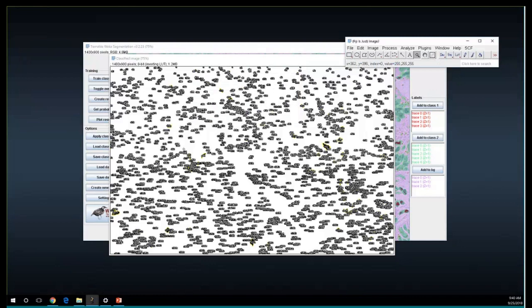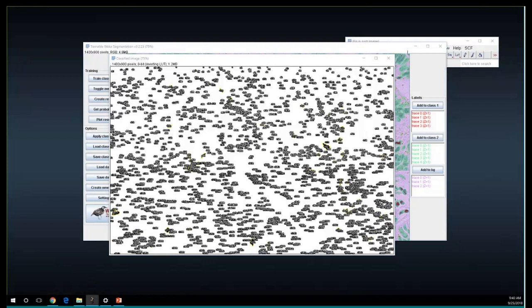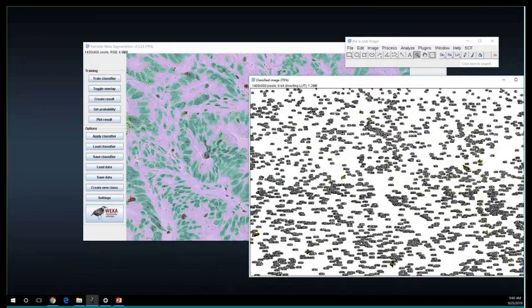But also there are tiny particles that don't represent the real dot, a single dot for the probe. So the best way to do that is you want to go back to your original image, and estimate what the number of pixels within a single dot should be, and then based on that number, you're going to get rid of very small results. Like here, let me show the table again.